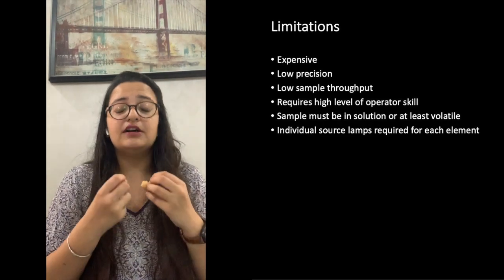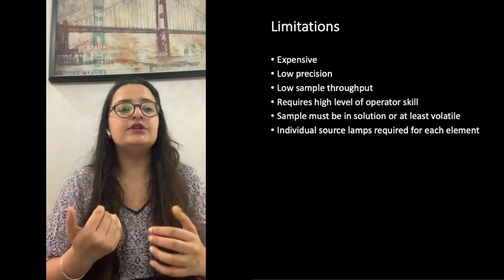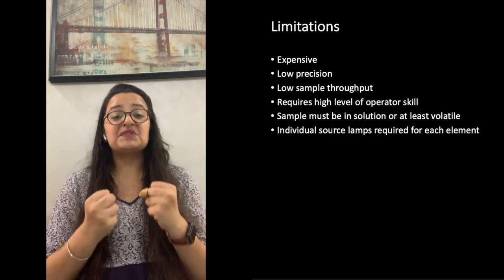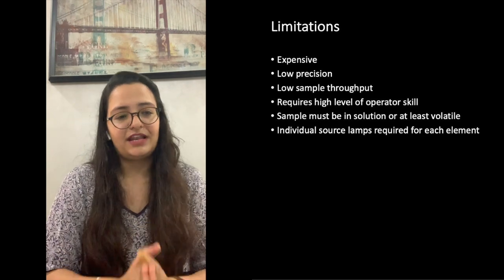It is expensive. They have low precision, low sample throughput, and require a high level of operational skill. The sample must be in solution or at least volatile, and an individual source lamp is required for each element.